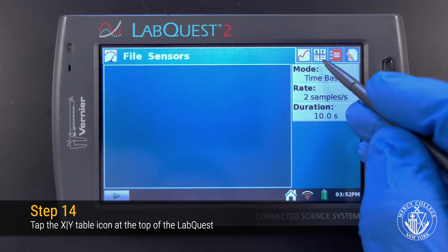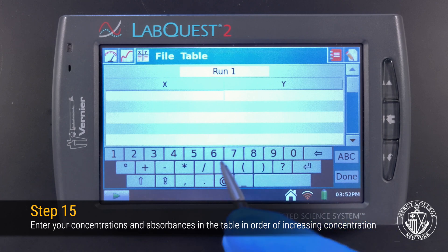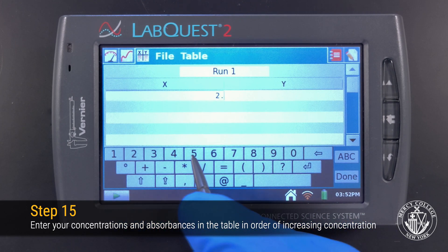Now select the Table tab from the top of the LabQuest. This will bring you to a table where you can enter the concentration and absorbance values you recorded for your standards.